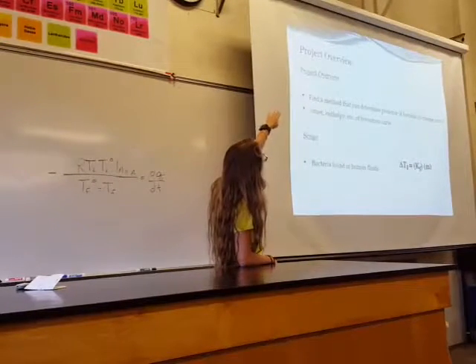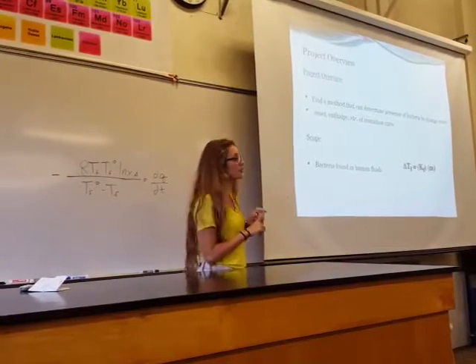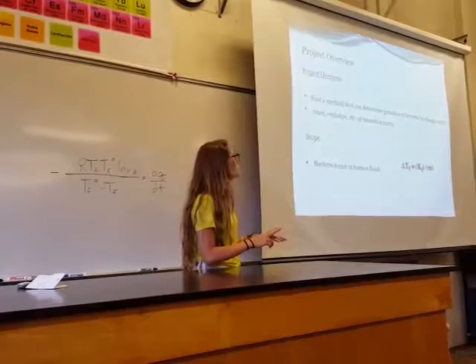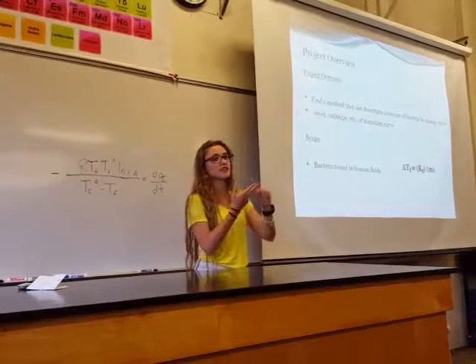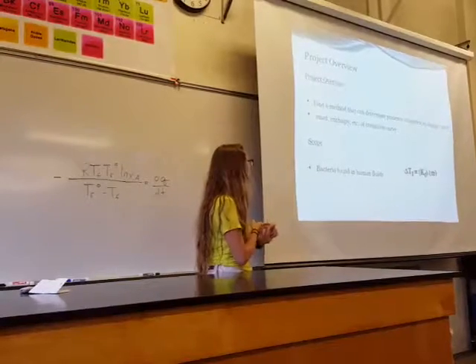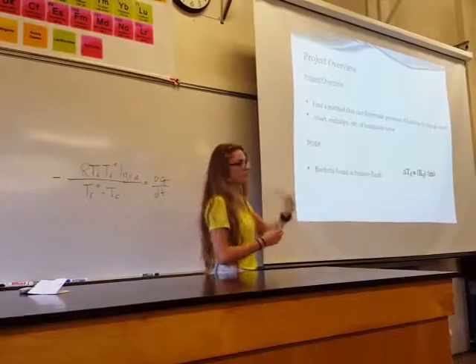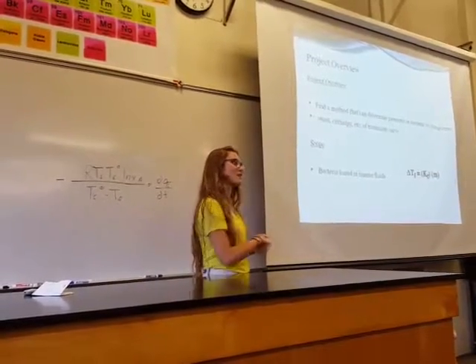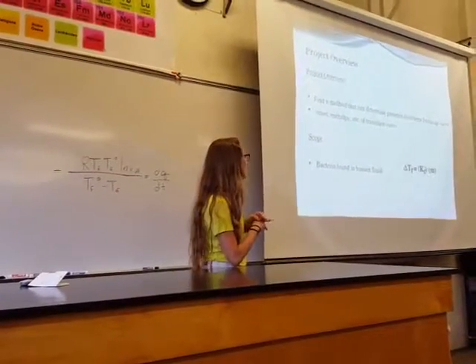So our project overview was to first find a method that could determine the presence of the bacteria, and to find the different analyses that would be able to detect that. Our scope was initially the bacteria found solely in human blood. However, we used whatever bacteria was available to us at the time.